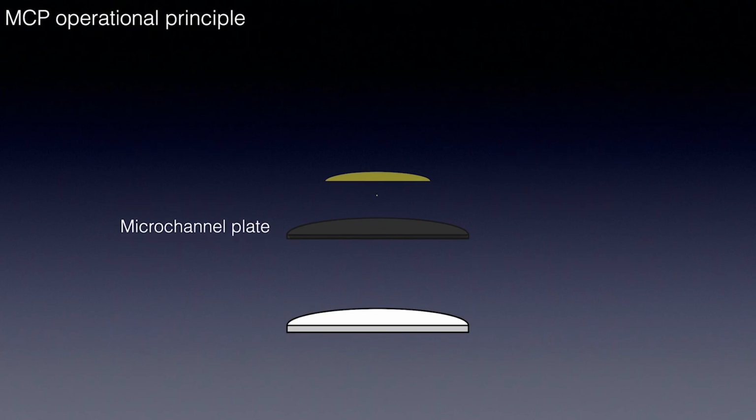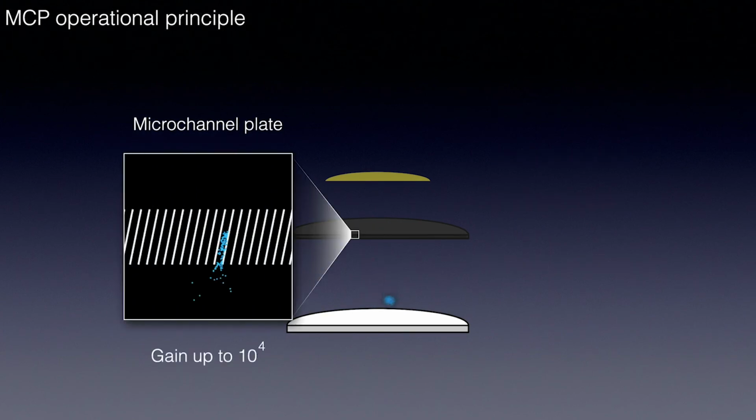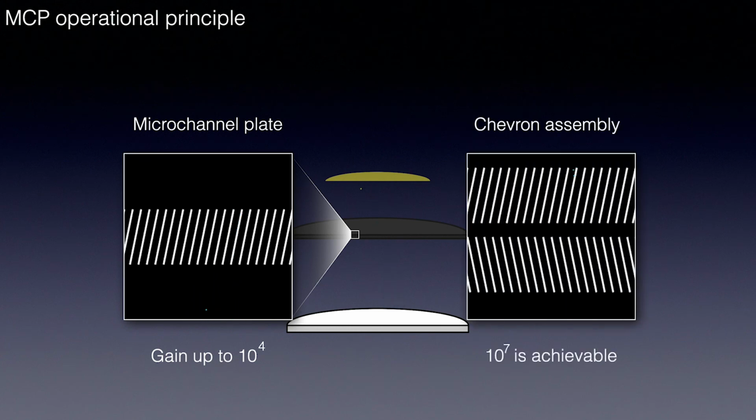Let's take a closer look at what's going on inside the MCP. In this cartoon, you can see the amplification process of a single charge carrier by the channel of the MCP. Commercially available plates gain up to 10 to the power of 4 electrons for a single initial photoelectron. Typical channel diameter is about 10 microns. Due to various reasons, we use an assembly of 2 MCPs that can gain us tens of millions of electrons. This amount of charge is something that we can start working with.